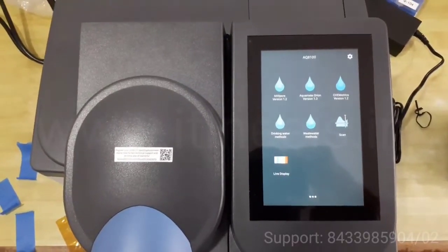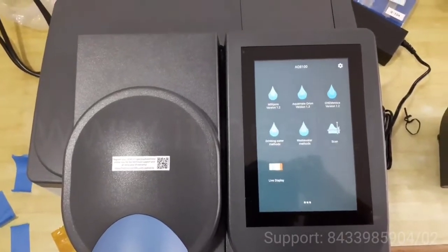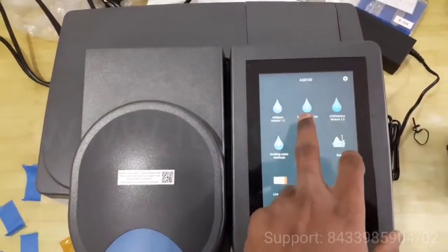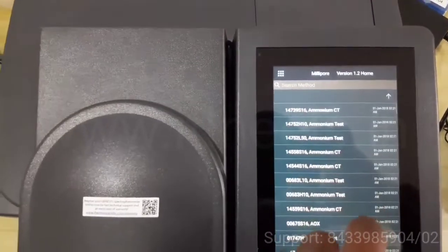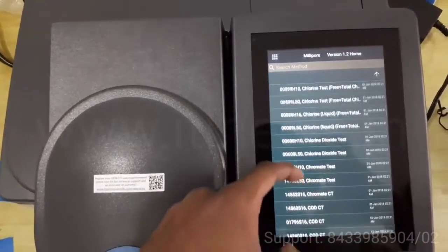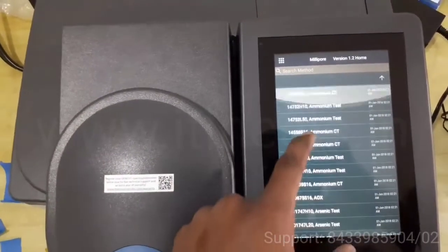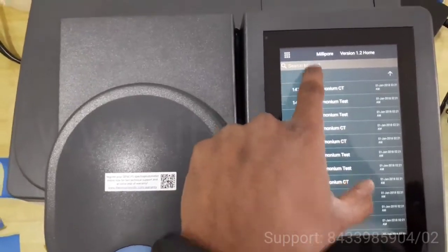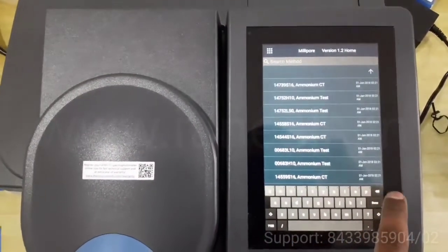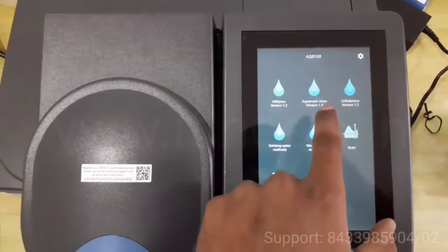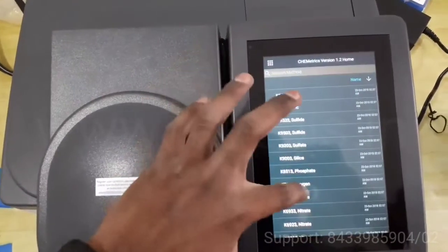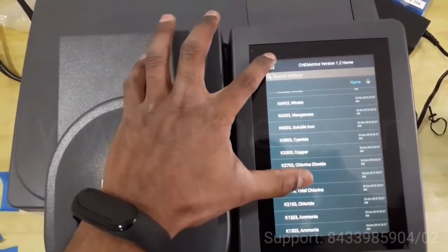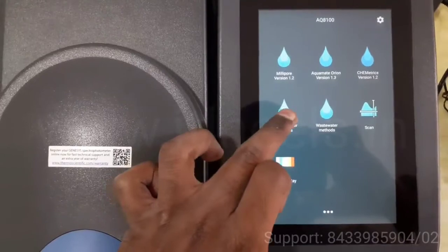This is a UV plus visible spectrophotometer. The range is 190 nanometers to 1100 nanometers. There are various pre-programmed folders available, for example Millipore. In this, there are various tests you can select. You can also search from here.